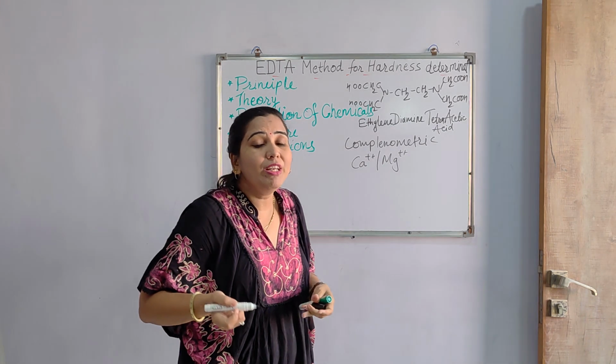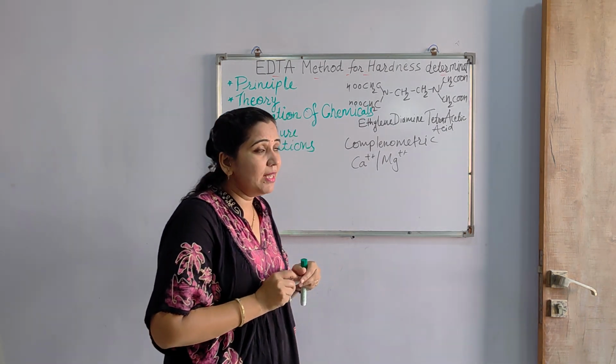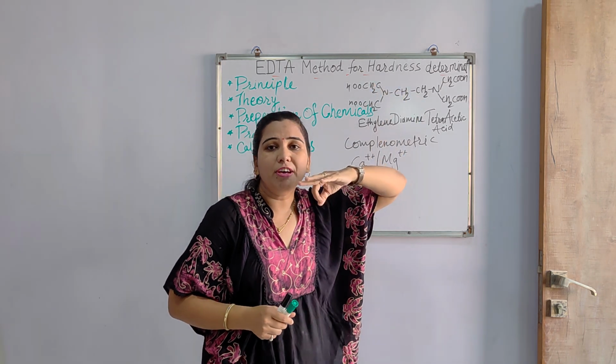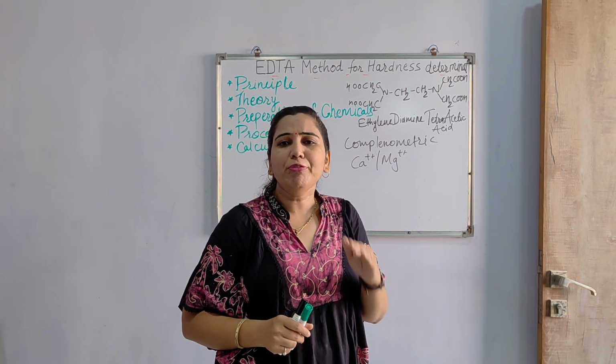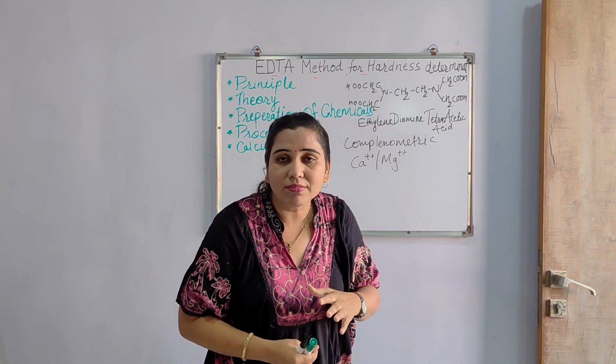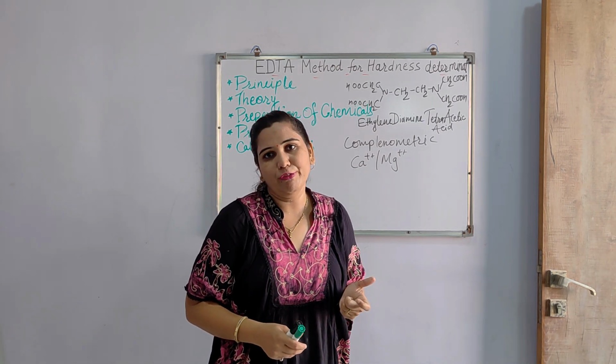But how will we use it? See here, one thing is very important. This EDTA, as it is a ligand, is a very stable structure. It is very difficult to react, and it is very difficult to dissolve in water. That's why we use the disodium salt of EDTA.